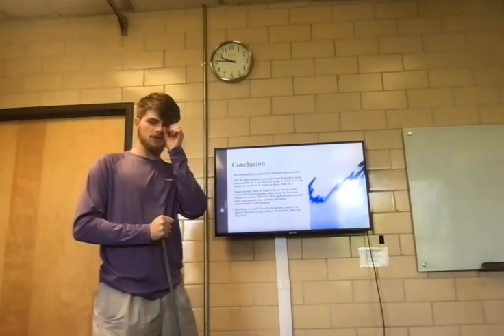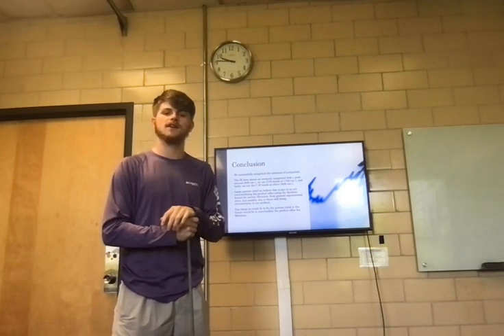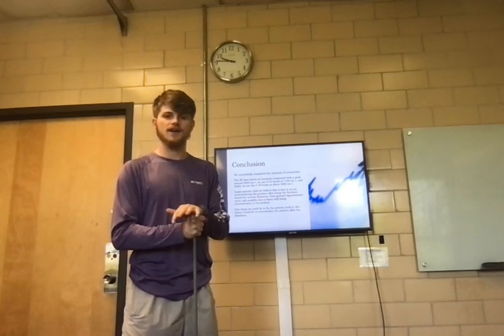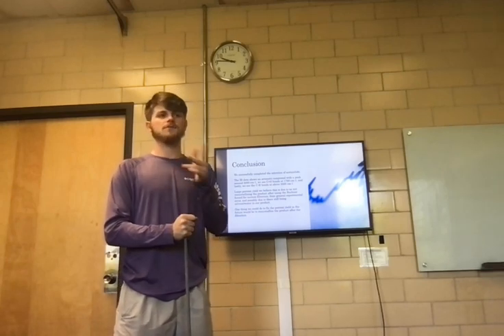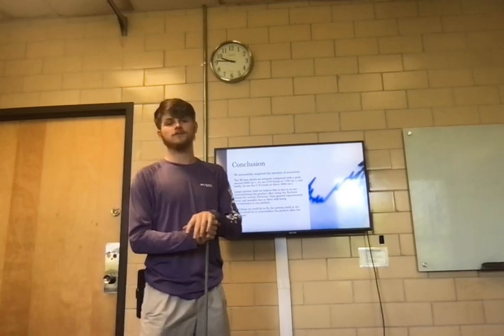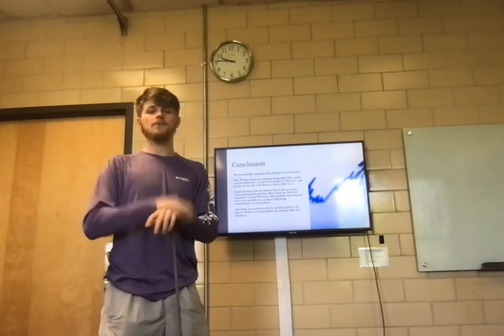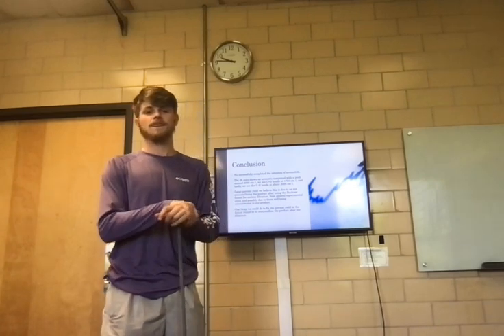Okay, so to conclude our experiments, our group can successfully say that we nitrated the acetanilide and created nitroacetanilide. As Brody just showed you on the data results, our IR does confirm that for us. We have an aromatic compound around 2000, the ring that is.